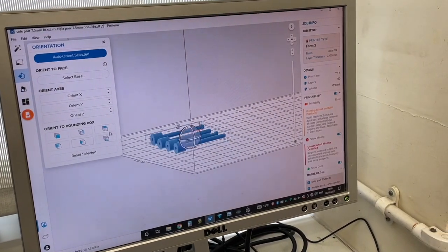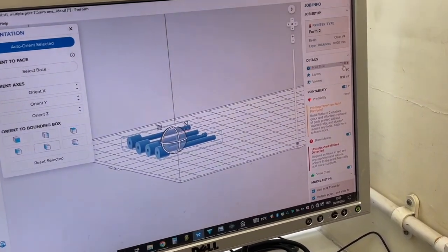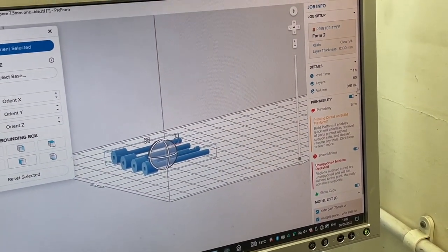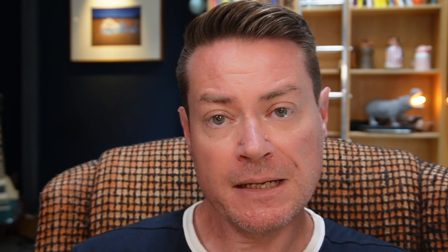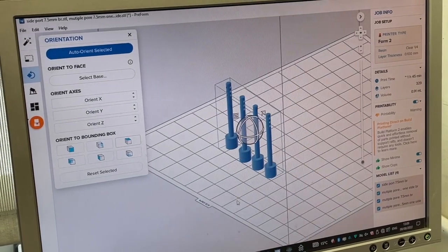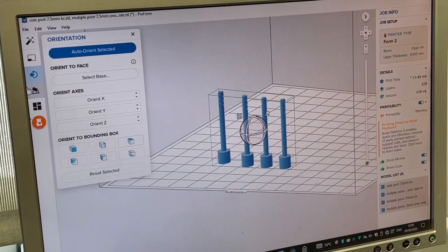Orientation is also important. Some printers, including our own, print faster in the horizontal direction than the vertical direction. Thus, it is significantly quicker to print an object when oriented horizontally than vertically. However, faster printing usually means lower resolution. So if you want to print something with the best resolution, it needs to be oriented vertically. This will take longer to print, but the final object will look better. Depending on the shape of the object, you may be able to arrange more objects on the build plate in the vertical direction.